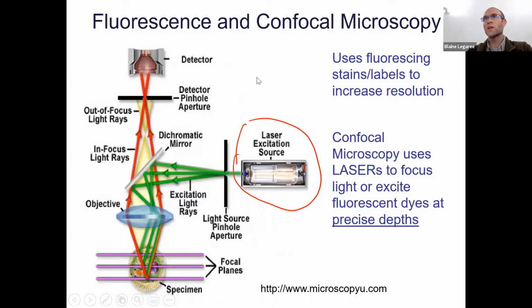So a normal light microscope, for a good one, you're looking at $5,000 to $10,000. For a cheap fluorescent one, you're looking at maybe $20,000. You're starting to get to more expensive optics, and when you're starting to add lasers and things like that, it gets a little bit more sophisticated. I'm going to talk about this other technique called confocal in a moment, but let me show you some pictures of fluorescence microscopy.